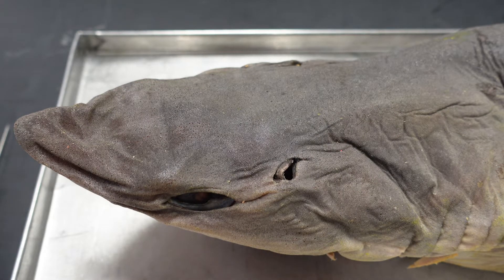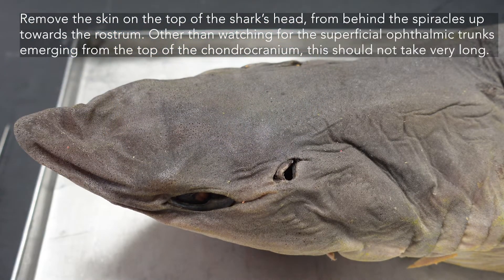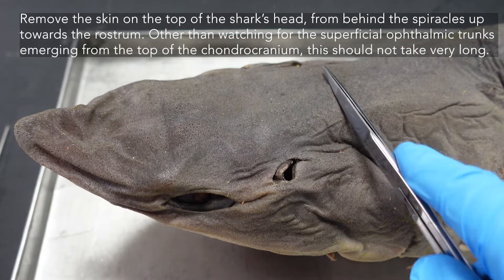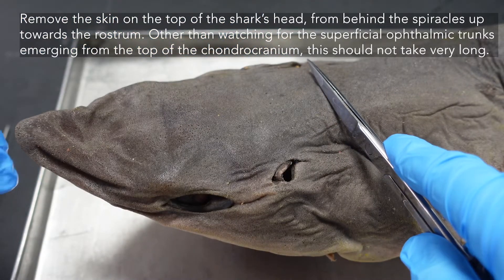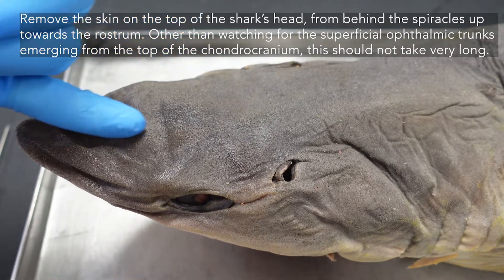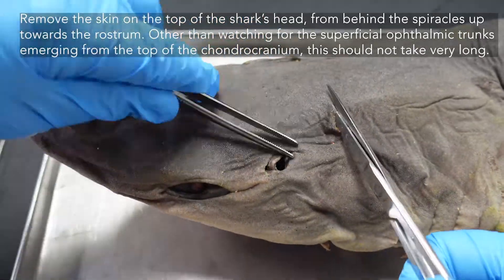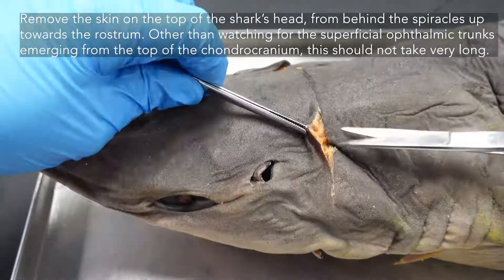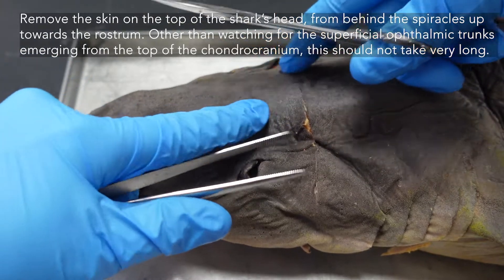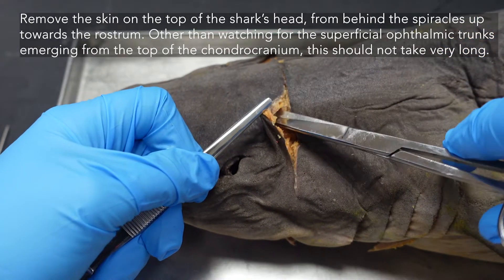We're looking at the shark brain today, and to access the brain we're going to be removing the top part of the chondrocranium. The best way to do that is to first skin the top of the shark's head so you can see where you're going, and skin from behind the spiracles forward. After that we'll be cutting through the chondrocranium — start with the middle compartment and then work your way outwards. You don't have to be very delicate cutting through muscle here; we will be removing this muscle anyway just to access the back of the skull, so you can be pretty coarse about this part.